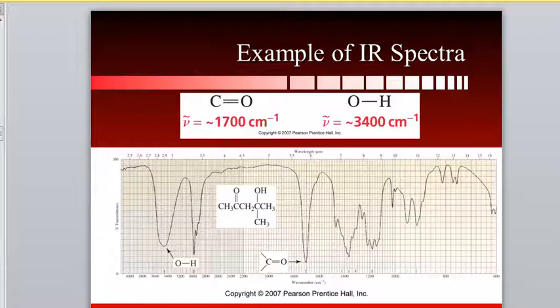So, the job for me in infrared is to look at these dips in the spectrum and to walk away saying, by looking at these squiggly lines, well, your molecule has an OH group. Well, your molecule has a C double bond O group.